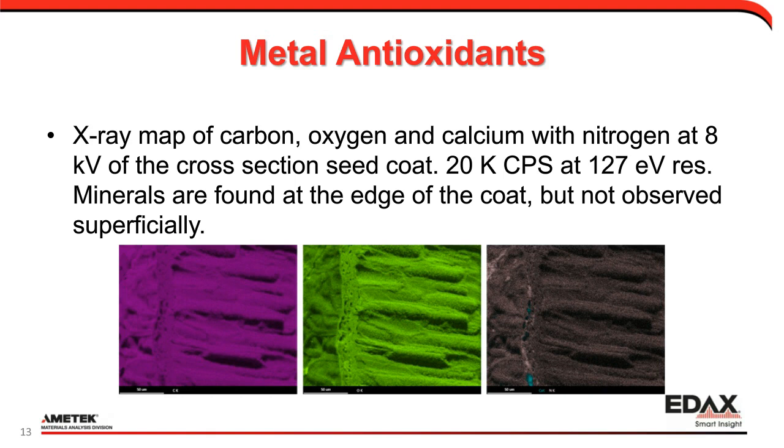So to now apply some cool and interesting facts and figures to real world work: the seed industry, the plant industry, the growing industry is so important for all of us who eat anything plant-based, which is probably most of us. Any time you have an experiment where you want to look at how much calcium is present in the seed and what the impact on growth rate is, you can use EDS to study the correlation between calcium in the seed and the solubility and germination of that particular seed after any presence or changes in the soil.